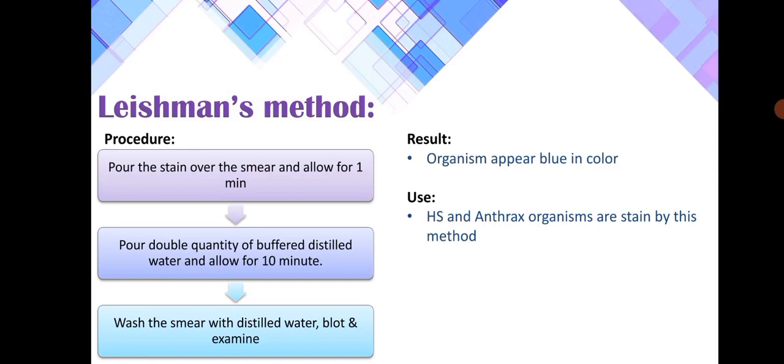Leishman's method, here the organisms appear blue in color, and organisms of hemorrhagic septicemia and anthrax are stained by this method.